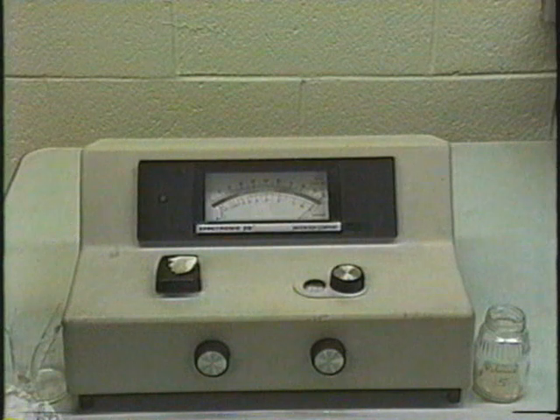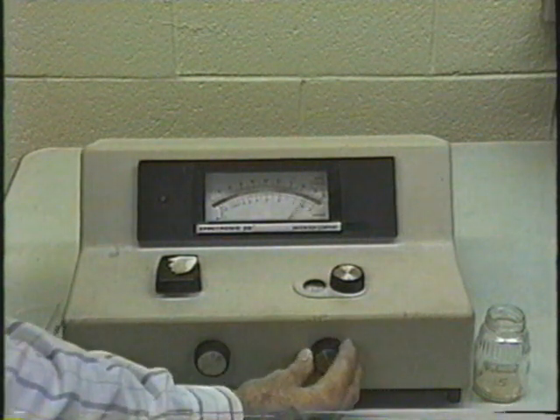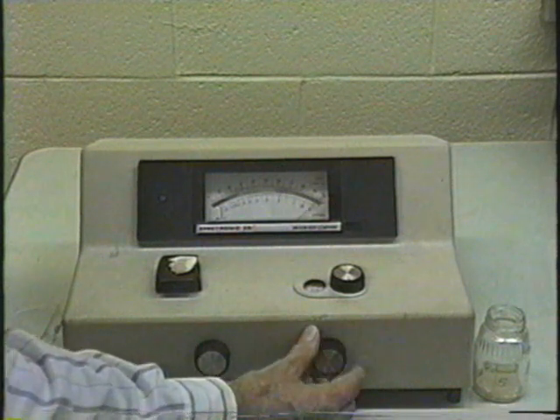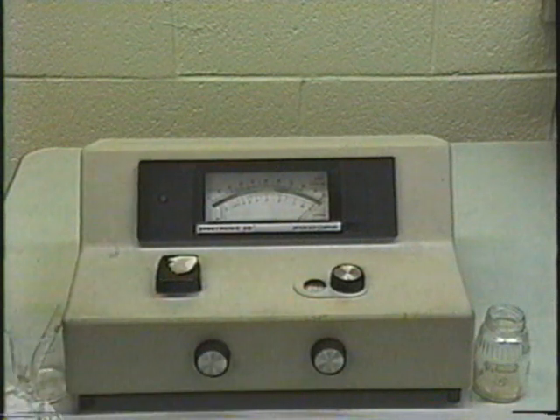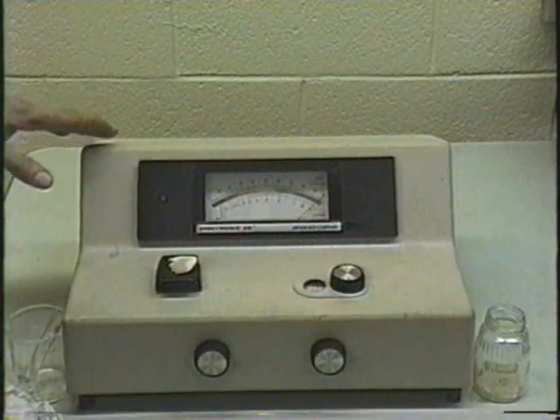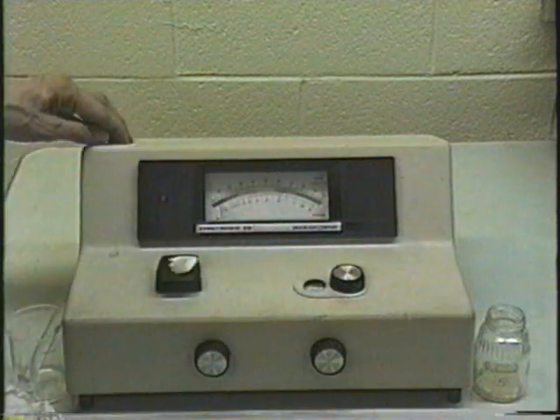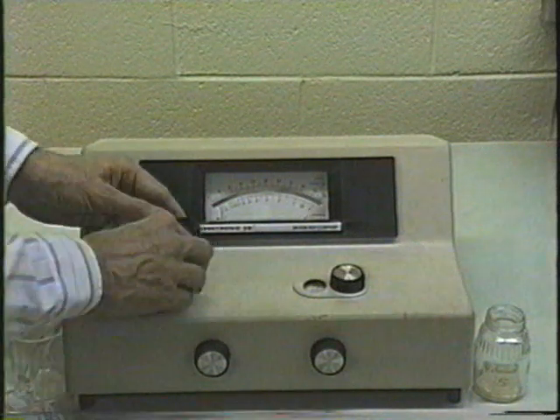Having nothing but distilled water, it should read 100%. If it does not, you can adjust it so that it does read 100% with this other knob, this second knob on the front panel here. So now you have the machine adjusted so that with nothing in, it reads 0%. With the reference in, it reads 100%.